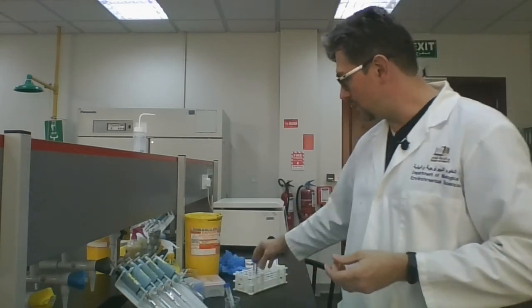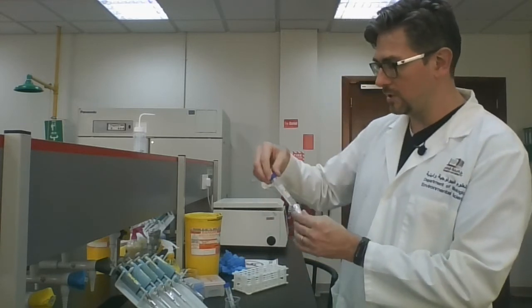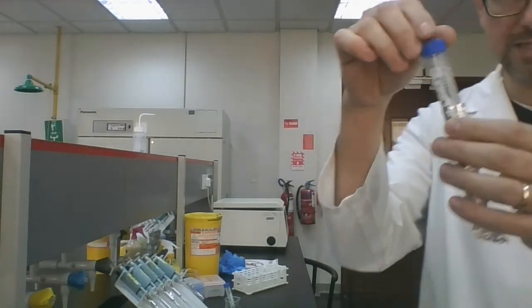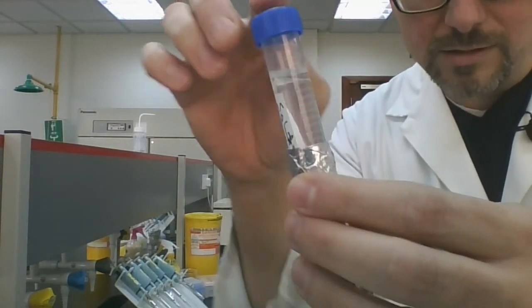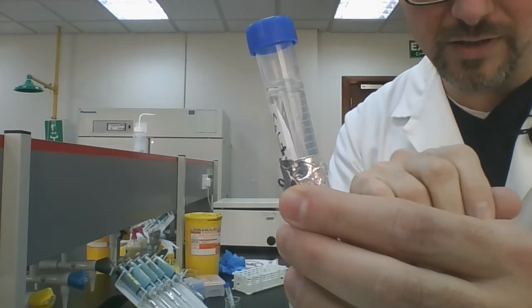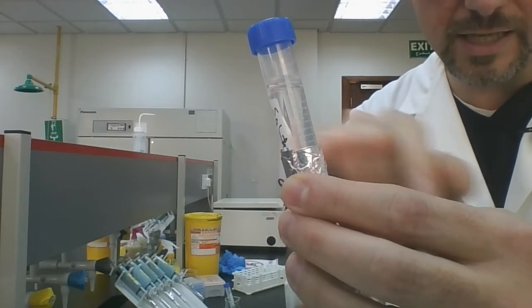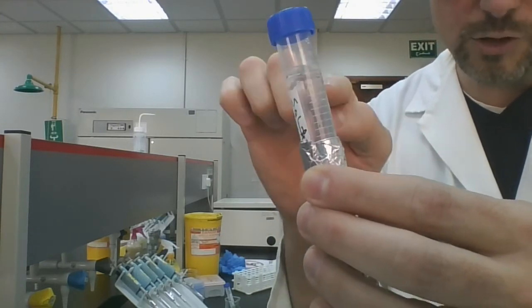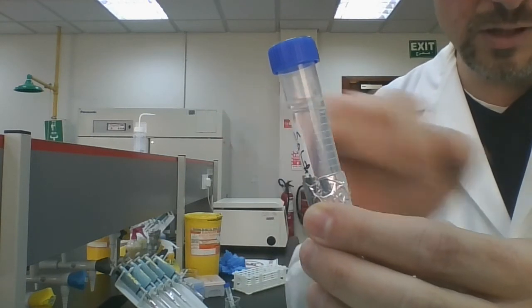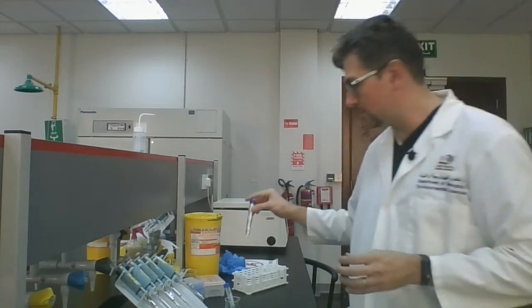You also have, this is solution D, okay? This is your phenol chloroform solution. One thing I want you to notice about this solution is that there's a small interface right there. On top you have a bit of water that helps to prevent evaporation. Down below is where you have the organic phase. So when you are taking the phenol from this tube, make sure your pipette tip goes down below that initial aqueous phase, down into the organic phase, to take out the organic phase, okay? So please be aware of that when you are working with the phenol chloroform.